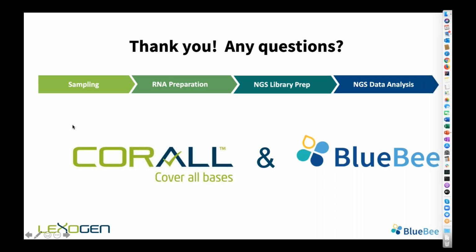Dear Martina, how many replicates are needed for reliable analysis? Also, did you compare GC-rich and AT-rich genomes? How well does CORALL perform in case of GC-rich genomes? So thank you, Petra, for that question. We haven't specifically analyzed GC-rich versus AT-rich genomes, but we have done CORALL library preps on many organisms, and it works equally well for different organisms, also for bacteria. And we never observed any GC bias.